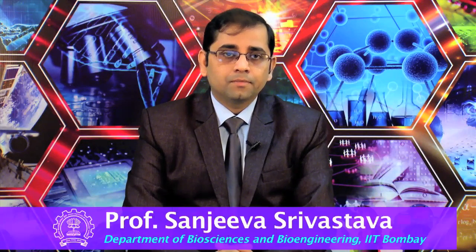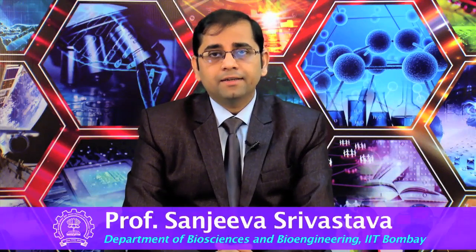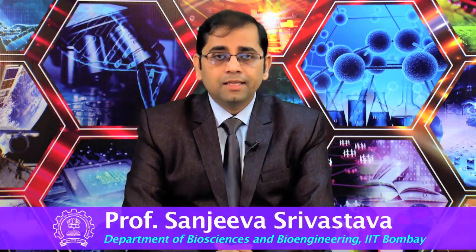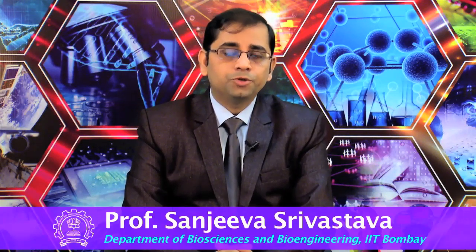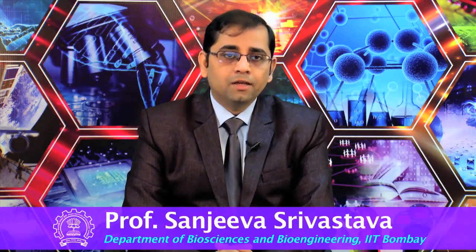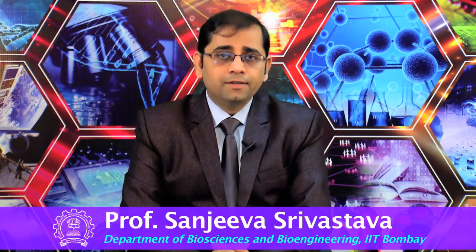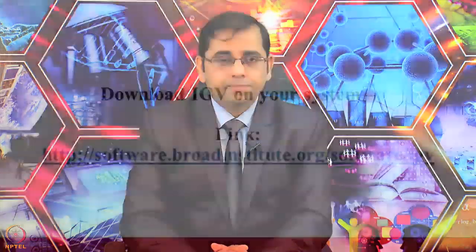Welcome to MOOC course on Introduction to Proteogenomics. After understanding the sequence centric proteogenomics, we will now listen to Dr. Kelly Ruggles and she will talk about how to use IGV using one of the examples of a human gene. The prerequisites for the hands-on is to download IGV on your system. If you have not downloaded the IGV yet, please pause this video and download the software to move forward.